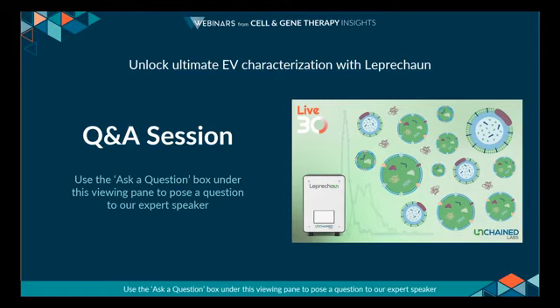If, I think in this example you referenced running the media and then comparing that to a positive sample, kind of a positive and negative sample comparison, you can do that, and in that instance, you can then just take the final results and subtract that yourself. So it depends slightly if you're comparing a positive sample to a negative sample, or if you're doing an internal negative control. Because if it's an internal negative control within a sample, then that will be done automatically for you in the software. Hopefully that's clear.